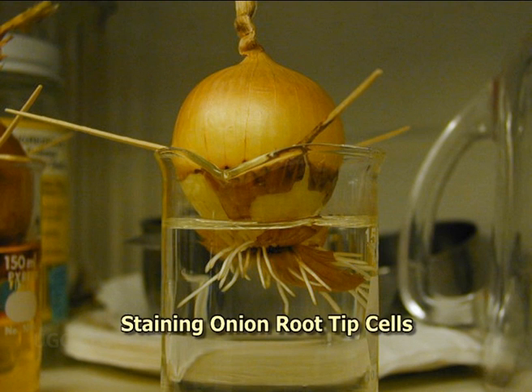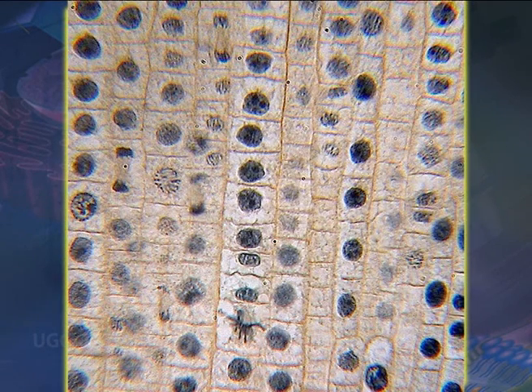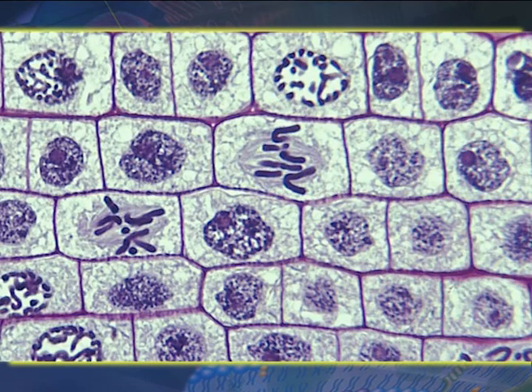Staining onion root tip cells. Onion roots and sprouting seeds are used to study cell division. Onion root tips are commonly used to study various stages of mitosis because the roots are easy to grow in large numbers. The cells at the tip of the roots are actively dividing and thus many cells will be in stages of mitosis.